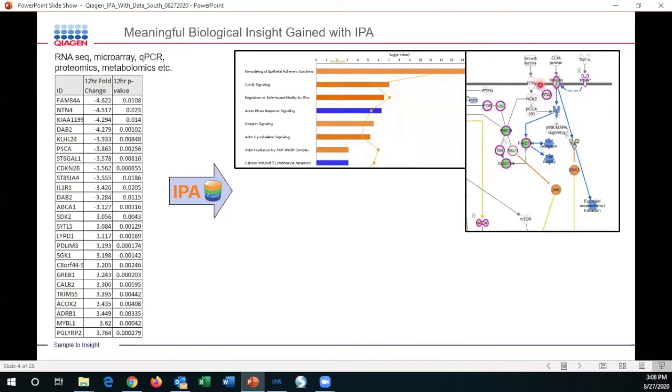And we can actually use that expression to make a prediction on a secondary level. We have perhaps assessed overall if a pathway is activated or inhibited, but based on the molecules we see changing in the pathway, can we predict how other molecules that we don't see changing through our assay, whether that's at the level of transcription, protein levels or metabolite levels, might be changing?